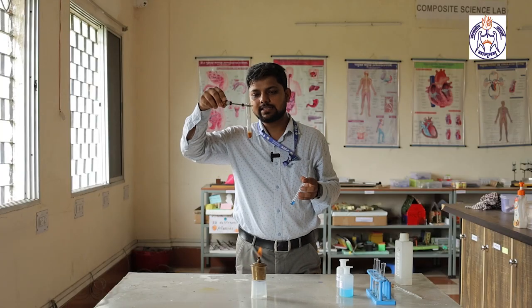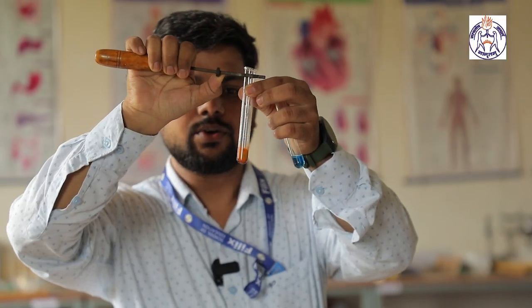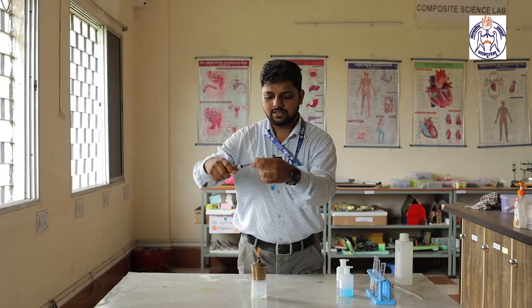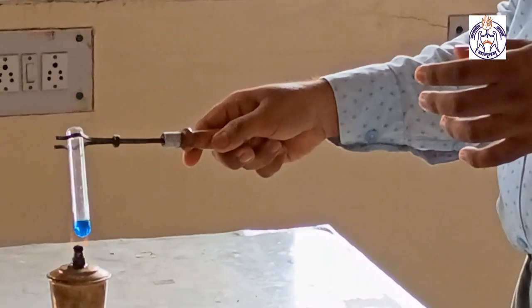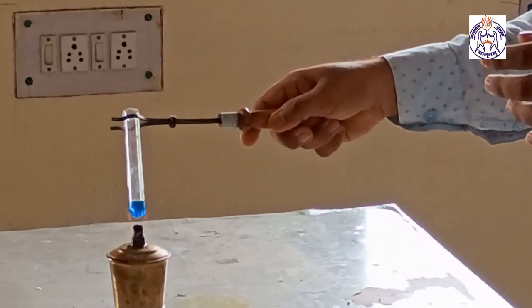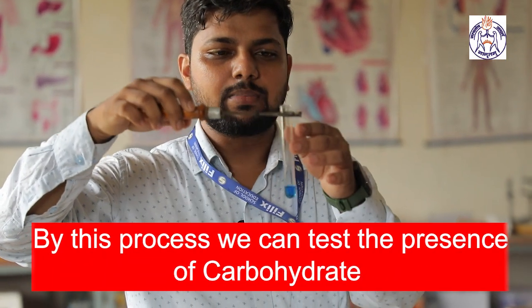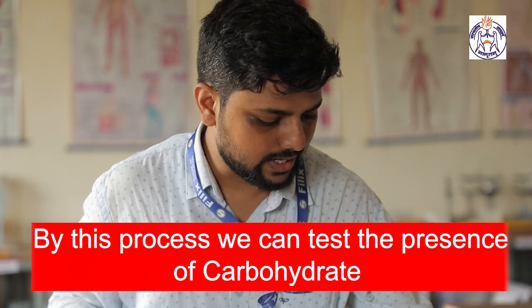So here in this sample we can see that carbohydrate was present and it converted into reddish in color. But in the second sample, if we burn it or heat it, we can see there is no change. So after heating also the color is not changing. By this process we can test the presence of carbohydrate in different types of food.